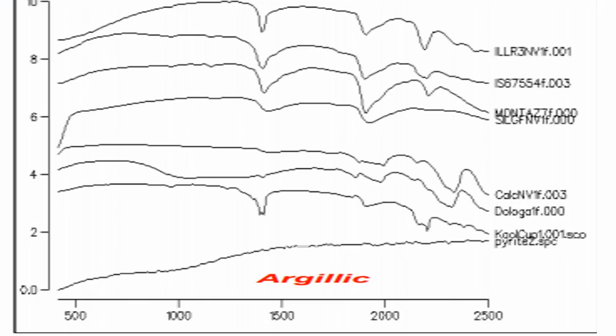Now, this plot will actually show the spectral shift in aluminum content and temperature change away from the vein, in a progression from illite at the top to the illite-smectite and into the smectite. This is why using a field spectrometer is so important for mineral vectoring and understanding where these low and high sulfidation deposits are.